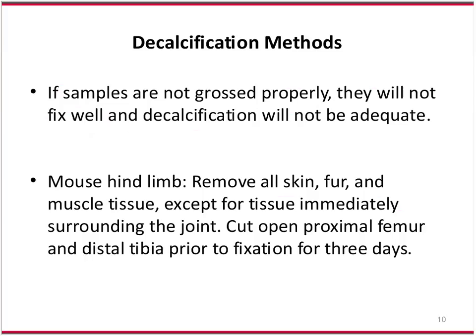If a sample is not grossed properly, it will not fix well, which means it won't decalcify well. If it doesn't decalcify well, it's not going to process well. It won't cut well, and it's just a downward spiral, the domino effect. If things aren't grossed properly in the beginning, the whole process is going to be terrible.